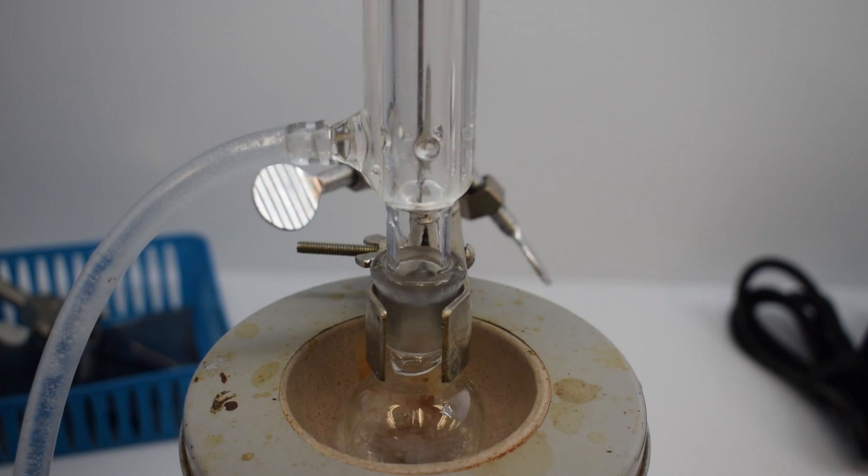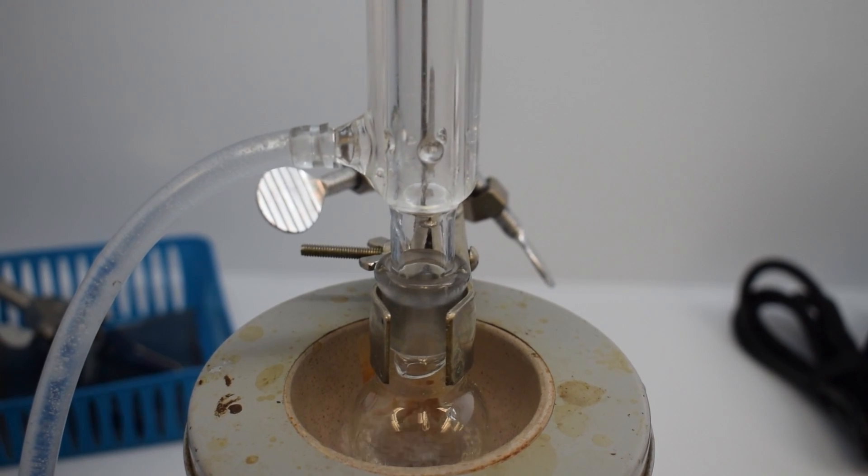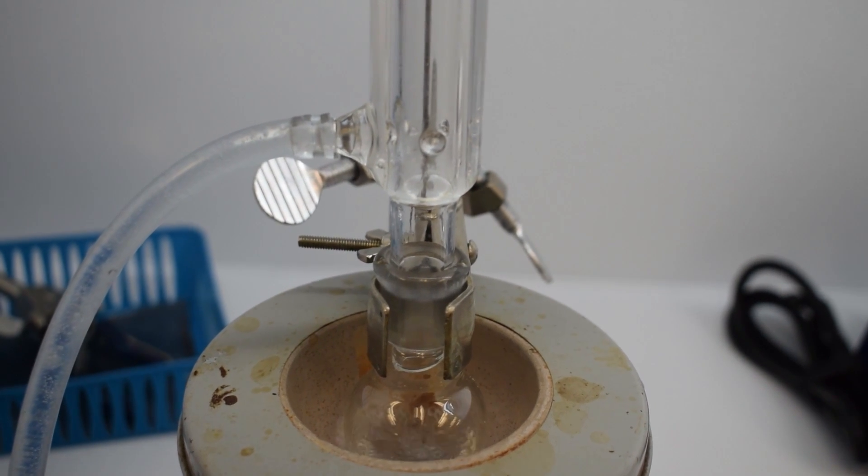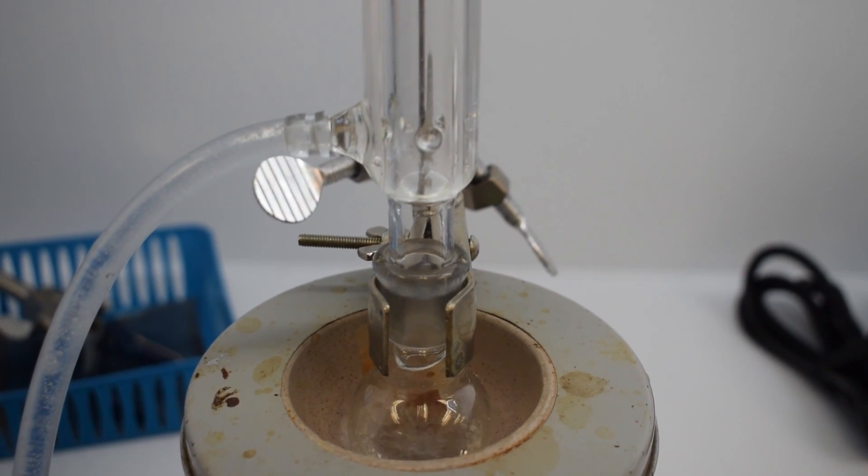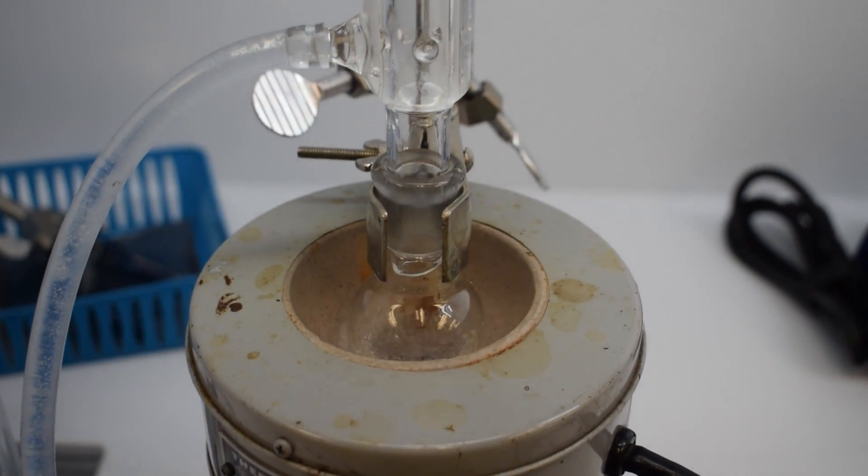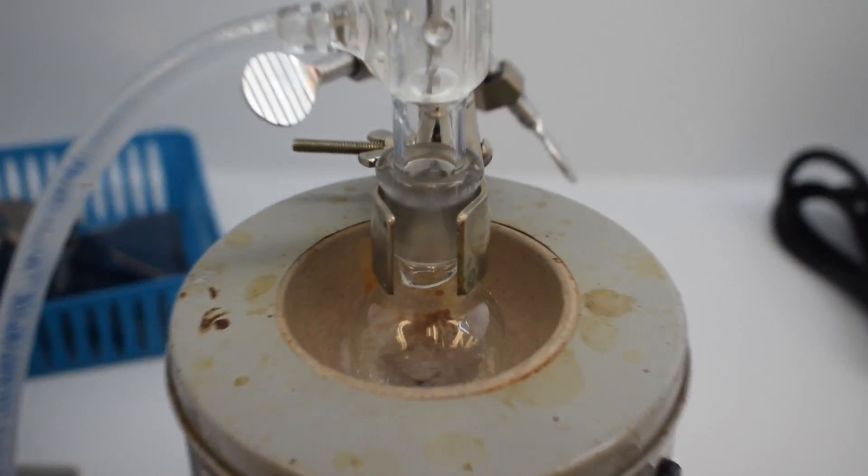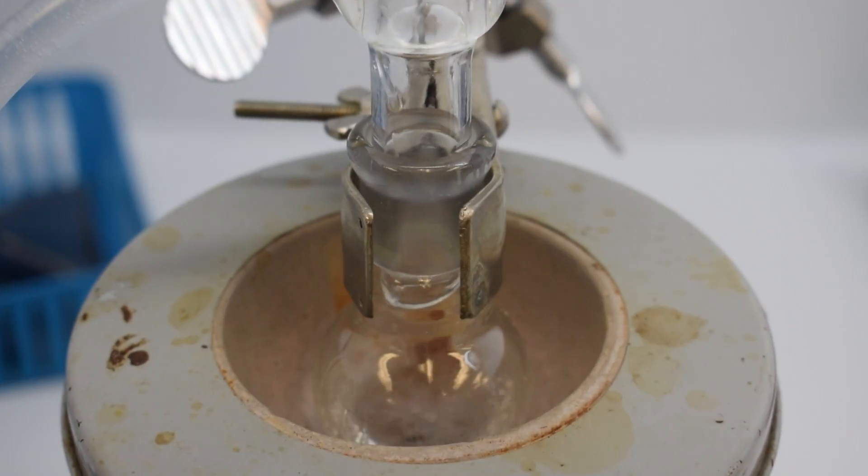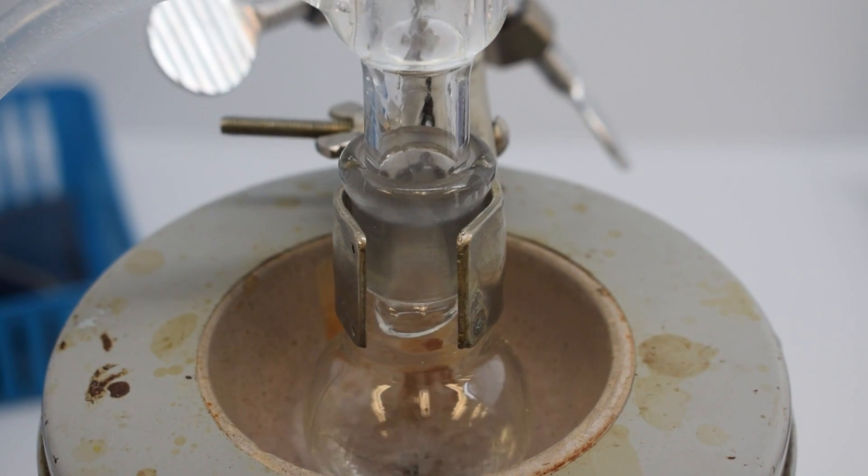Any water created as a byproduct of this reaction will also vaporize, but it will rise to the top of the condenser and reach the calcium sulfate drying tube where it will be removed from the reaction, pushing the equilibrium towards the product side.